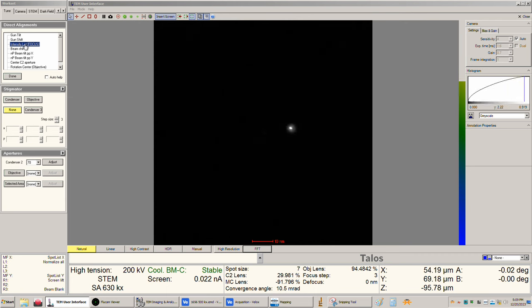So that's going to be something about, so not this, right? You're trying to get that caustic spot as tight as you can get it. Something about like, that's a little too much. Something about like, and again, there's going to be a little variation. Something about like that, okay?